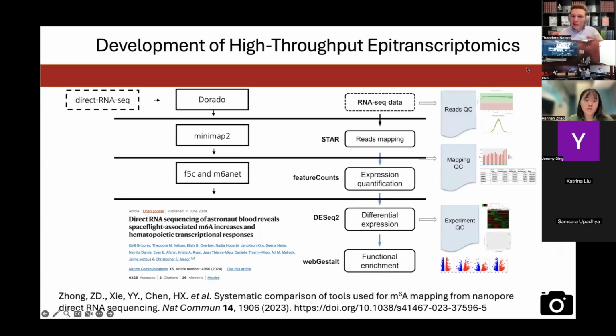It would be very hard to scale and apply globally to larger questions and to many different contexts and studies. So we started envisioning the nanopore direct RNA sequencing as following a similar trajectory and outputting not just gene counts, not just SNPs, but all of the various epitranscriptomic modifications and associations.